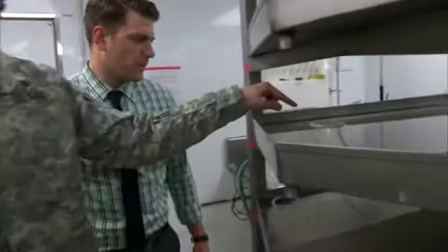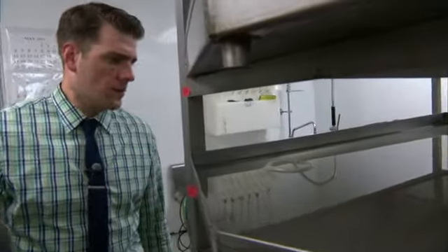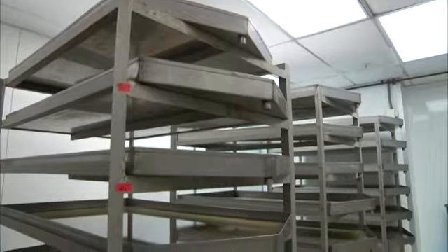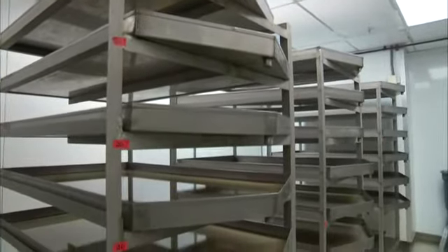So we add the eggs of the mosquitoes to these little rings to keep them in place. And then we add yeast for them when they first hatch out of the eggs. Then we add fish food later on. And they go through 4 different growth stages as larvae. We call those instars. Yeah, so it takes about 8 days from when we put the egg in there to when they're pupating. We're ready to pull them out of these racks. Okay, and then where do they go from the racks?